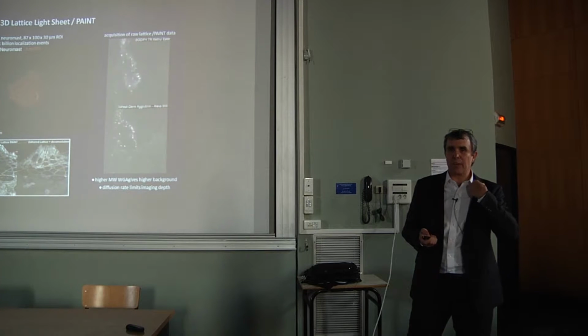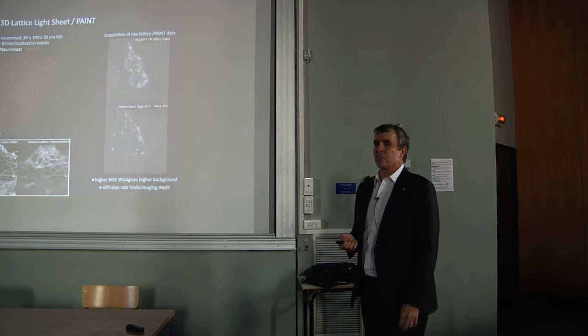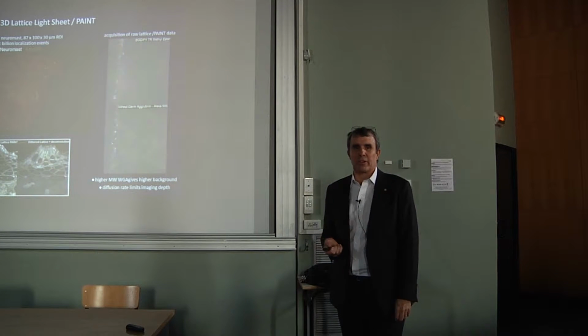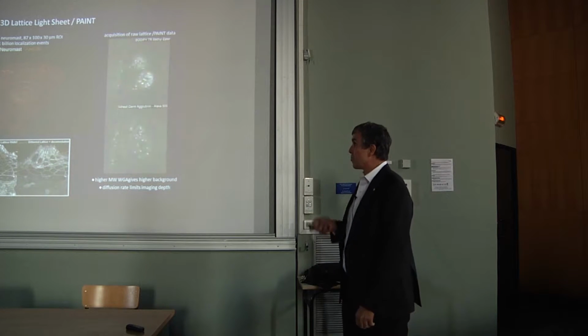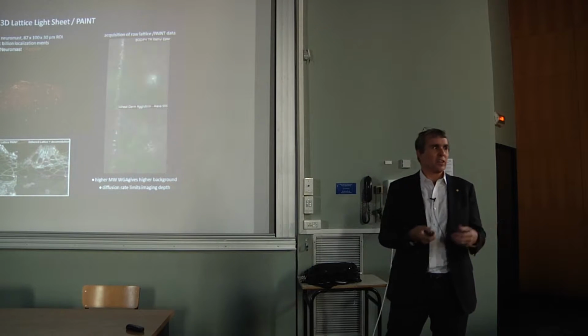So one thing PAINT is not is fast. So to localize 1 billion molecules took 10 continuous days of imaging in the microscope. And yet we still can register every molecule relative to one another over those 10 days to a precision of better than 10 nanometers.